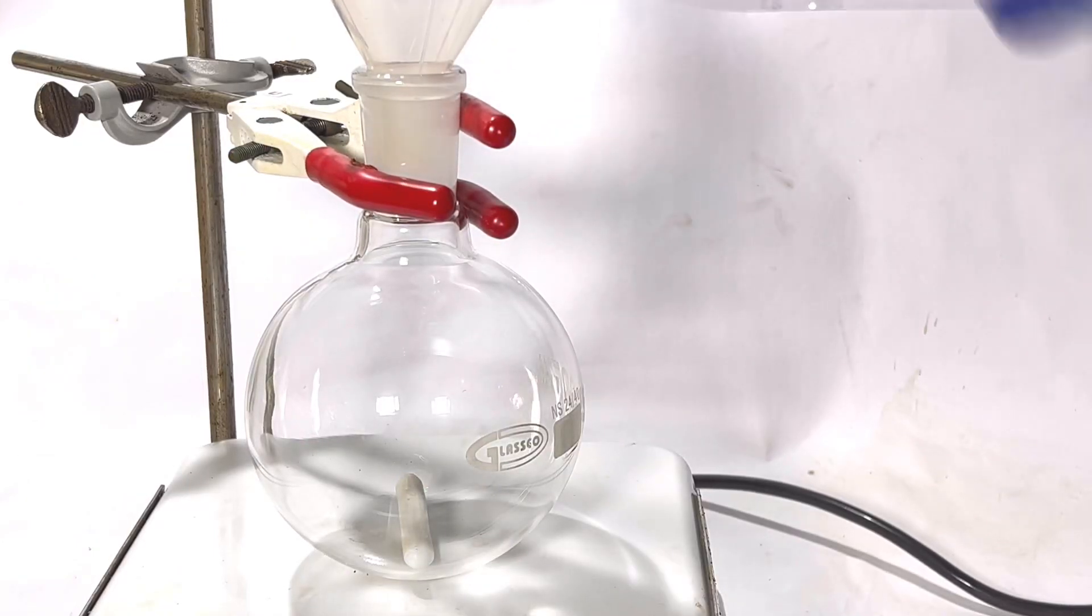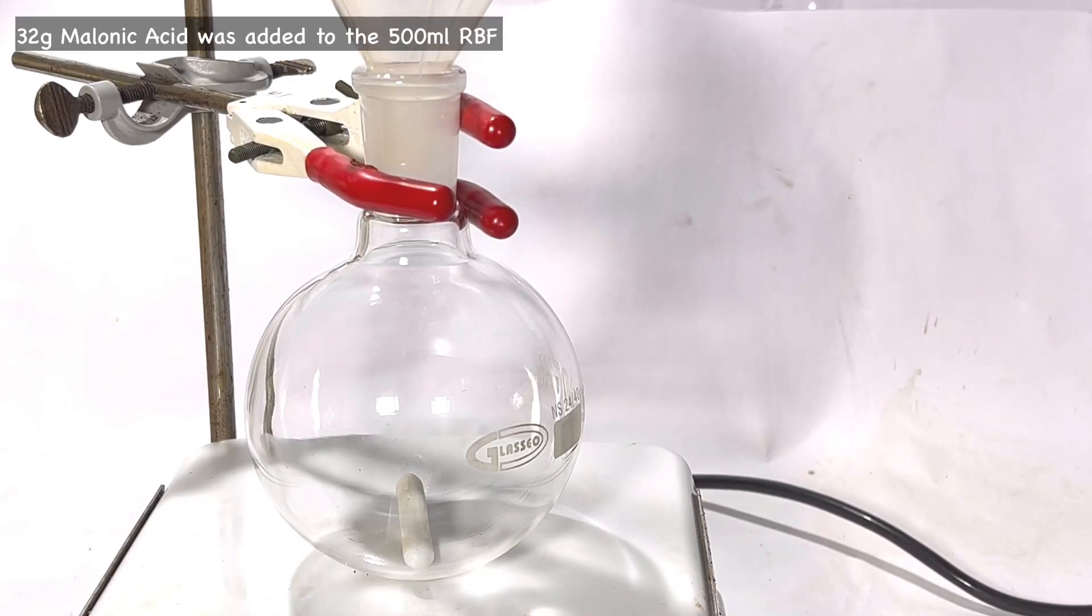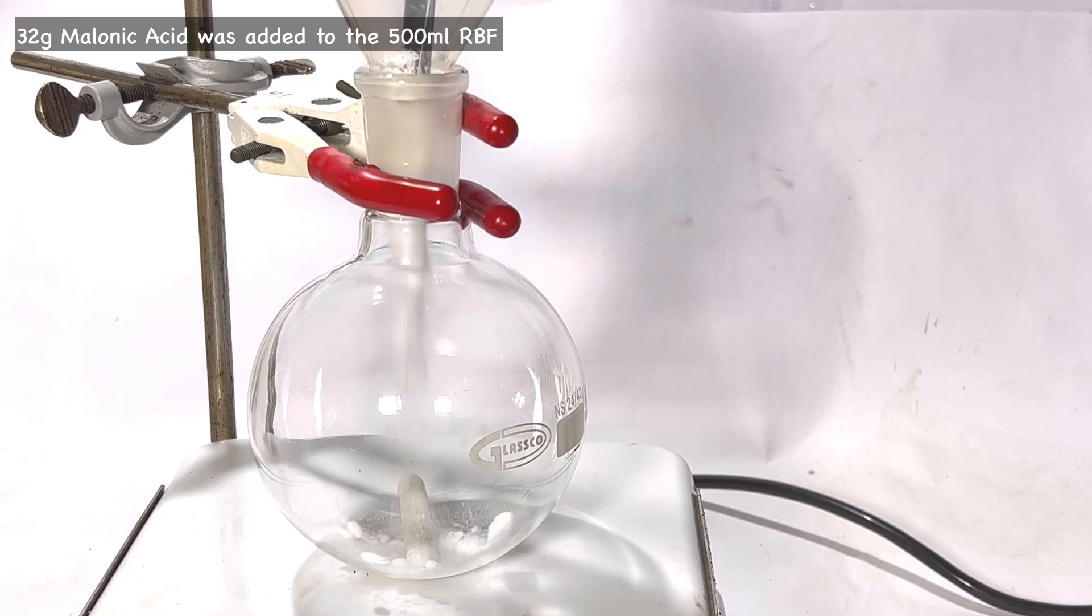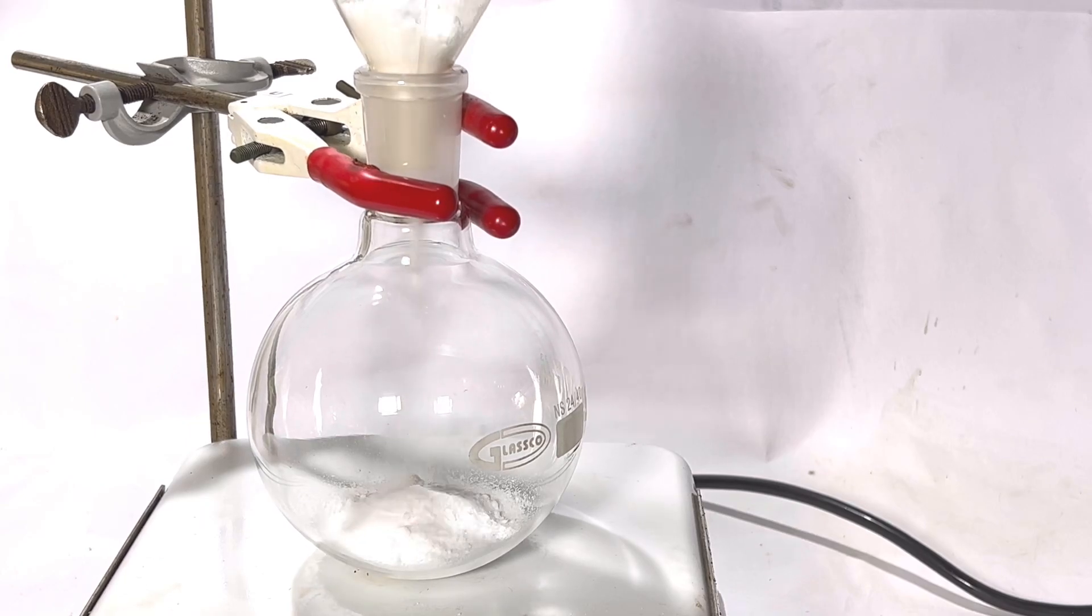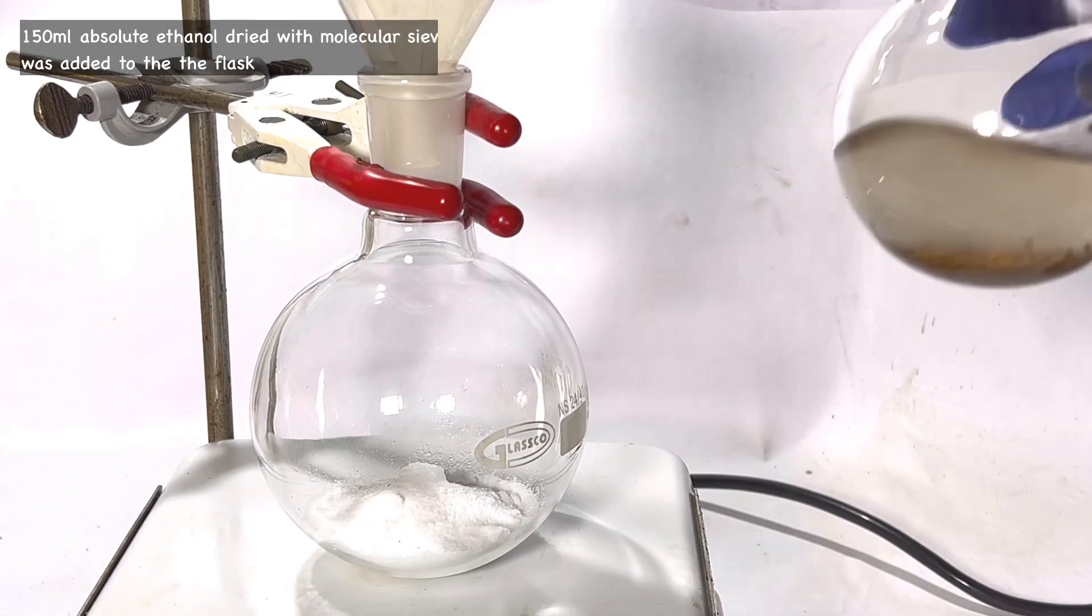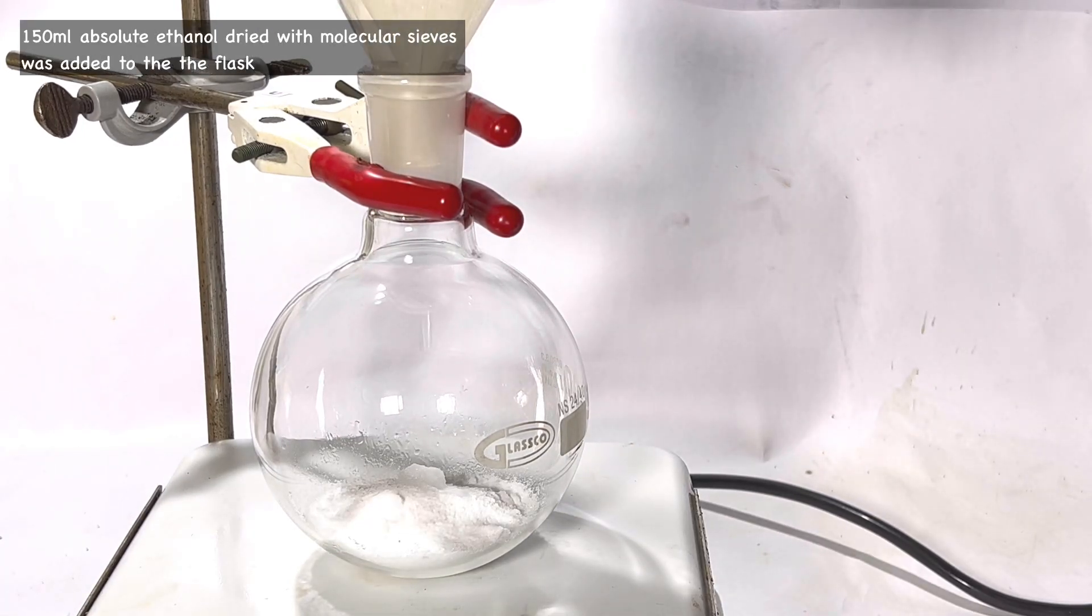Start by fixing a 500 milliliter three-neck round bottom flask on a hot plate with a stirring bar inside. 32 grams of malonic acid was transferred into the round bottom flask using a funnel.